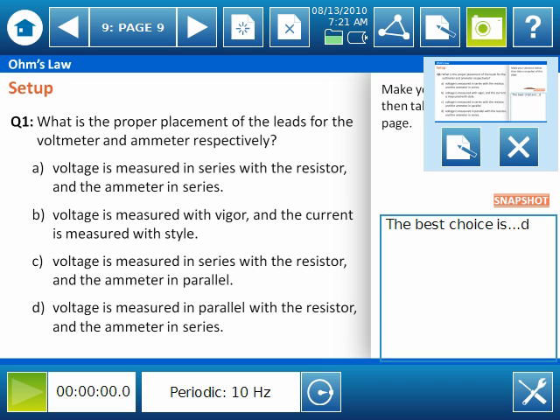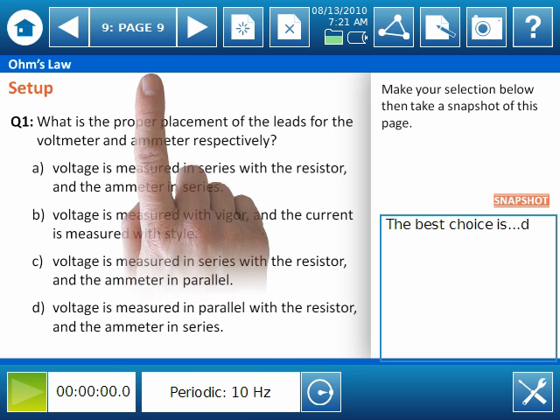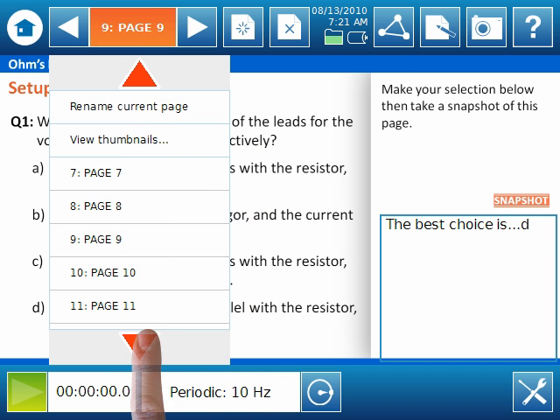Now, we'll jump to page 12 to begin data collection. A quick way to move from page to page without having to scroll through each individual page is to use the Spark Science Learning Systems page navigator. To use the page navigator, select the page number at the top of the screen and then select the page you wish to jump to.